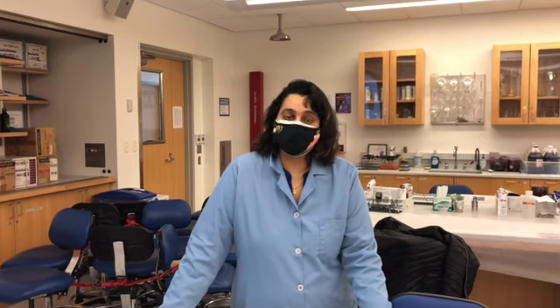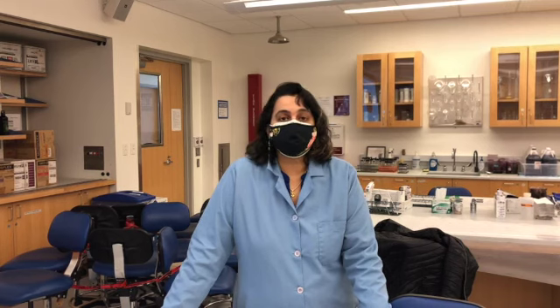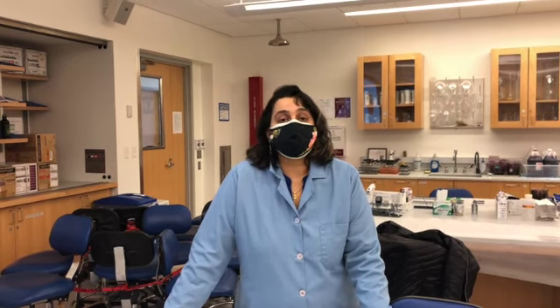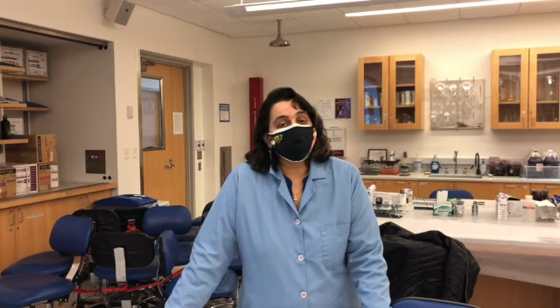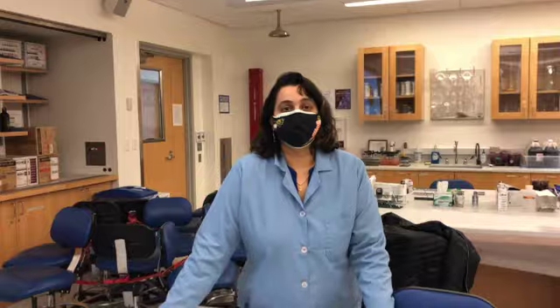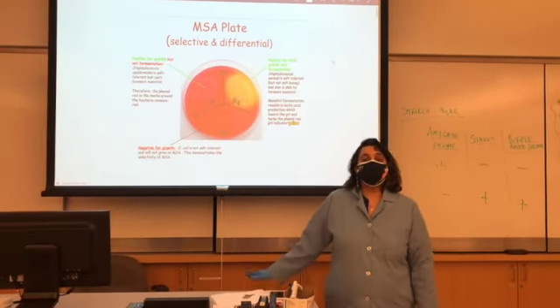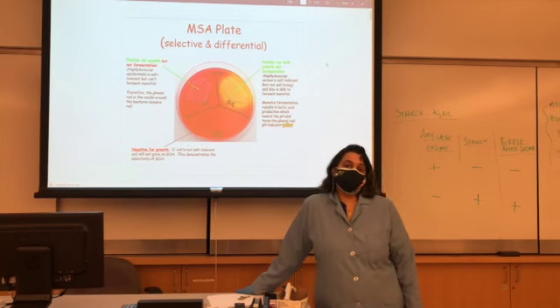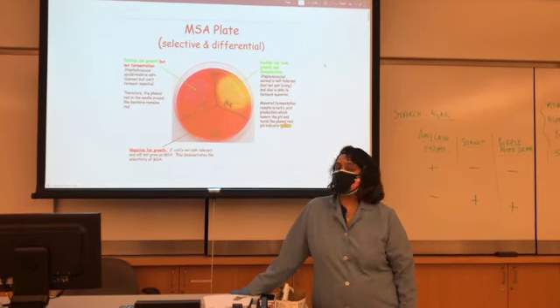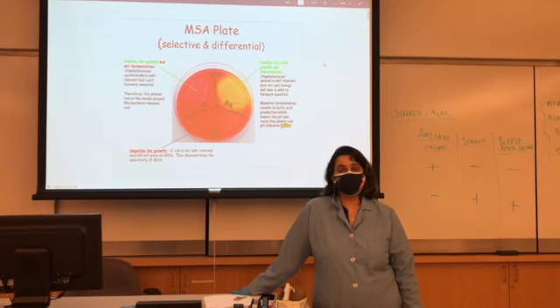Okay, so you did the streaking, you did the gram staining, and then you're doing some gram-positive diagnostic tests. So today's lab is all about gram-positive diagnostic tests, and later on we'll talk about gram-negative diagnostic tests. So let's begin with some of the very commonly done gram-positive diagnostic tests, and the first one is the MSA test, mannitol salt agar test.